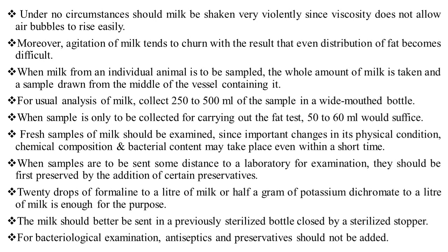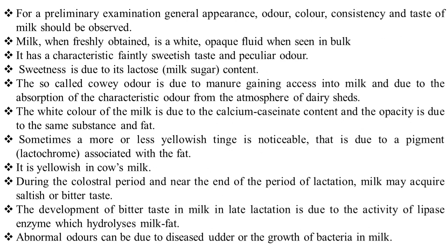The milk should preferably be sent in a previously sterilized bottle closed by a sterilized stopper. For bacteriological examination, antiseptics and preservatives should not be added. However, for examination, the general appearance, odor, color, consistency and the taste of the milk should be observed.